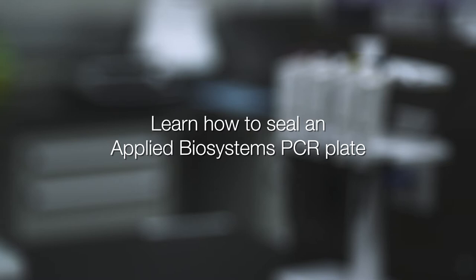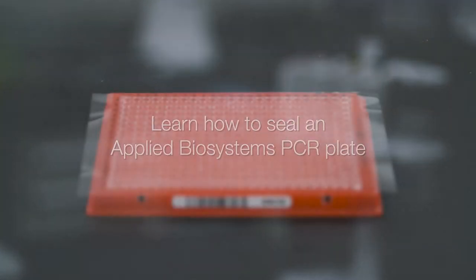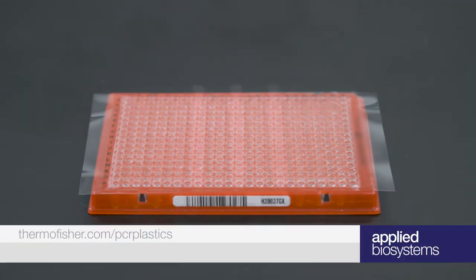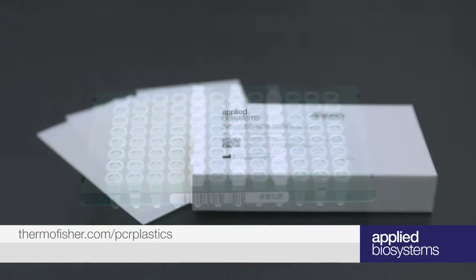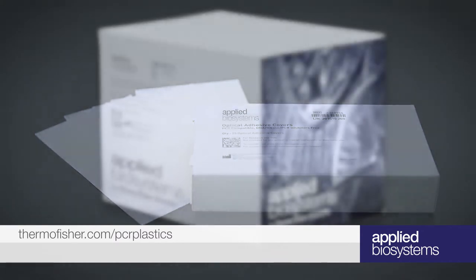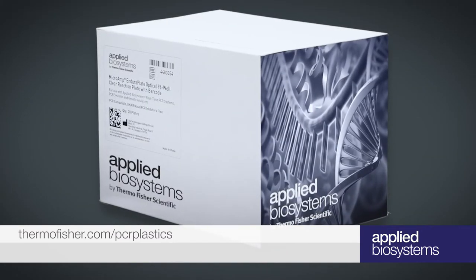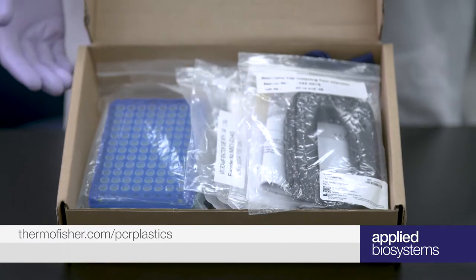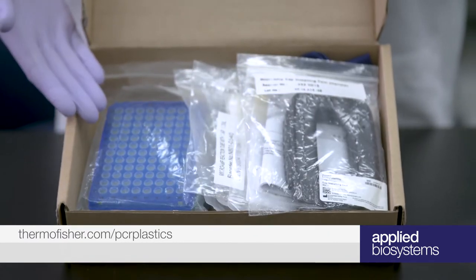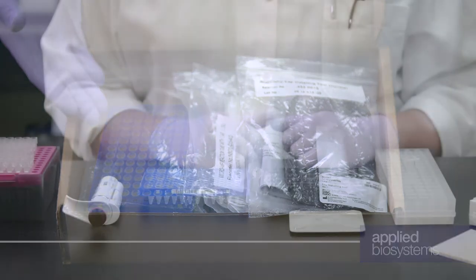In this video, we'll discuss how to properly seal a plate using two methods, the use of an adhesive film and cap strips. You can find everything you need for these applications in your Applied Biosystems Thermal Cycler Starter Kit, which comes with the purchase of a new Applied Biosystems Thermal Cycler or at thermofisher.com slash pcrplastics.